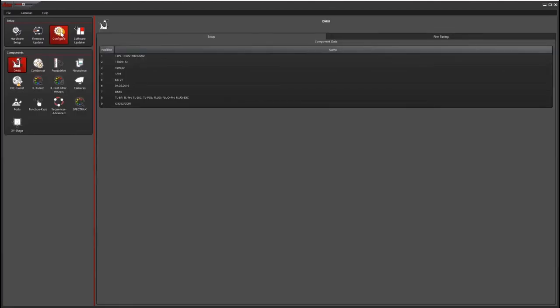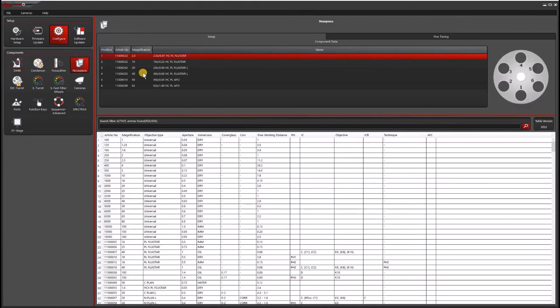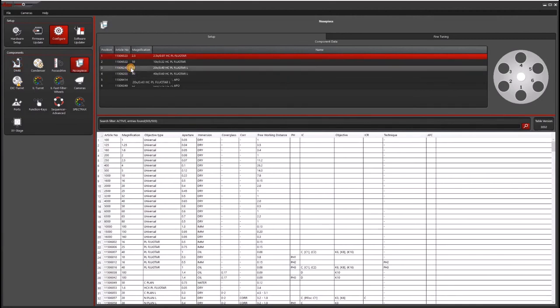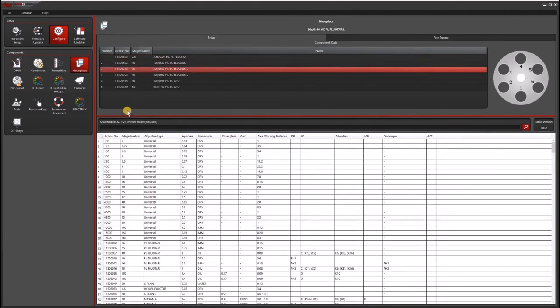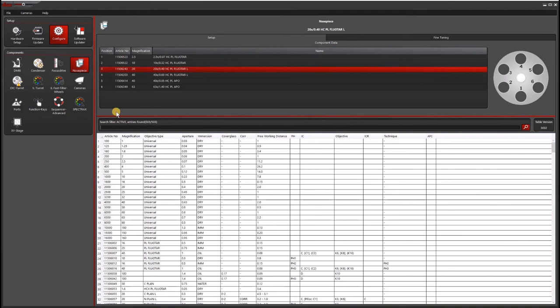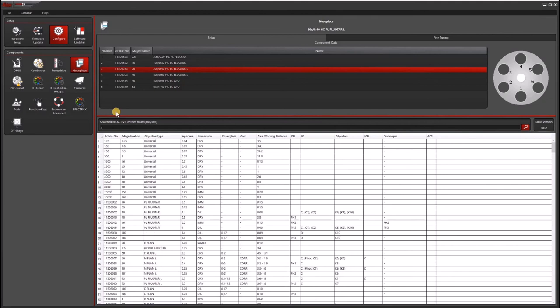The remaining steps are exactly the same as I showed before within LASX. You'd go to the nose piece, select the objective, and I'm actually going to change this back to my original objective, which has the last three digits of 529.